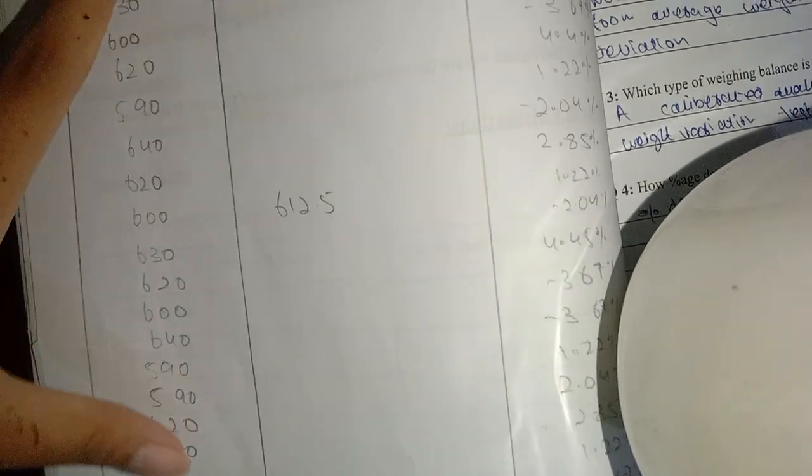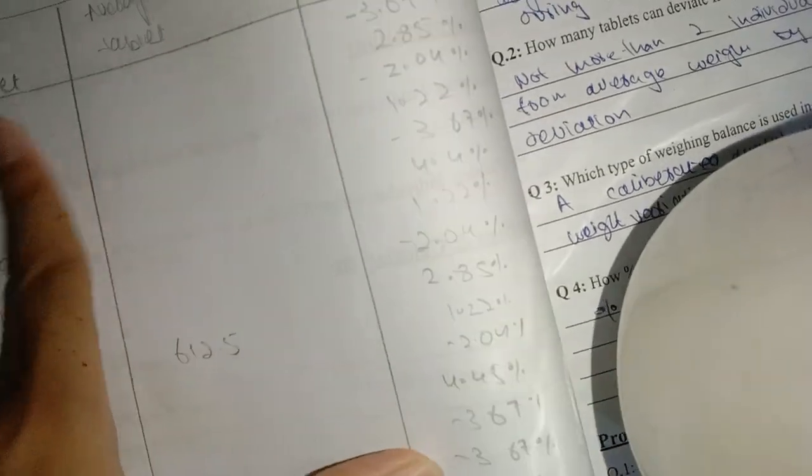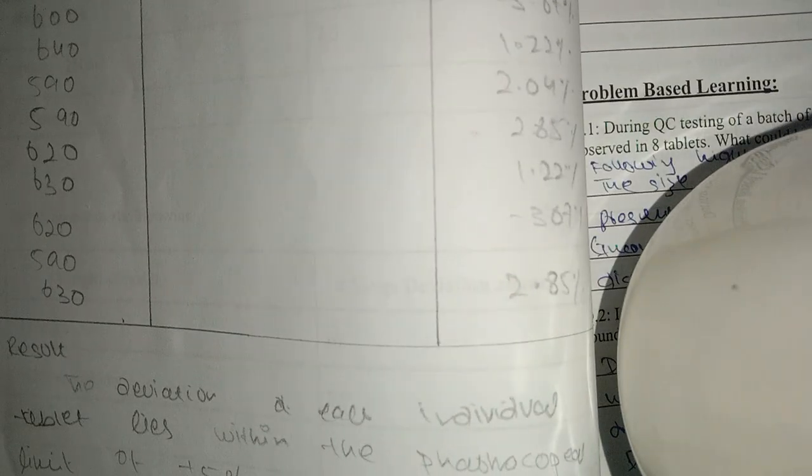Then you will complete your observations. The number of observations is 20. You want to calculate the average weight, and then you have to find the deviation for each. The deviation will be calculated at the end, and you will decide how the result will be based on these criteria.